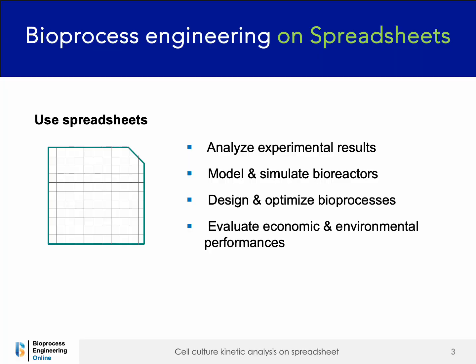You also learn how to use Spreadsheet software for key bioprocess engineering tasks, including analyzing experimental results, modeling and simulating bioreactors, designing and optimizing bioprocesses, evaluating economic and environmental performance.